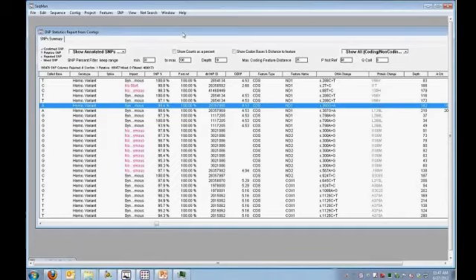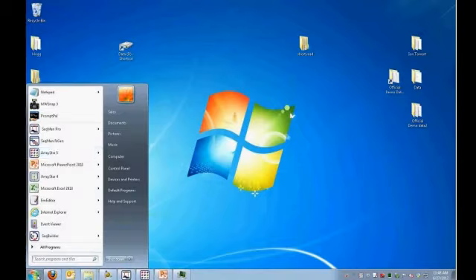If you have just a couple of genes of interest, you could do it right here in SeqMan, and I could find my gene of interest, scroll to it, look at the alignment view, and get my information that way. But if you've got thousands of SNPs or very large projects, we have another tool that can do that sort of analysis, and that's in our ArrayStar software. And I'll just launch ArrayStar here.